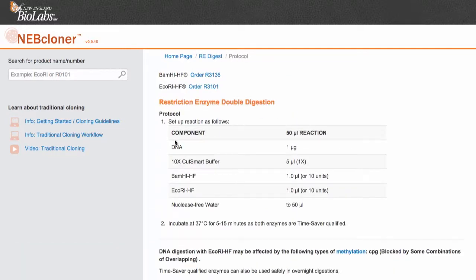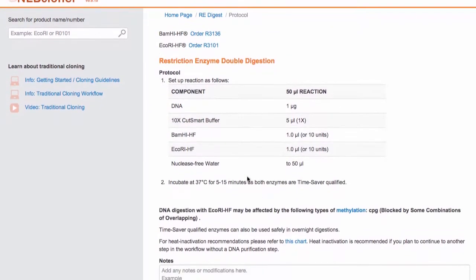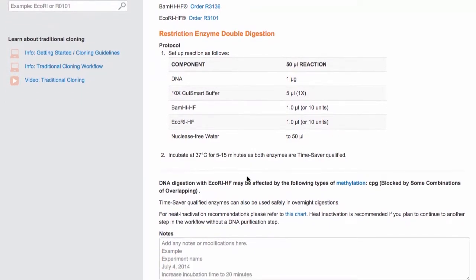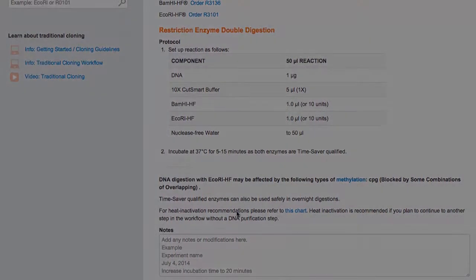Press Show Protocol. In the protocol, the tool chooses a common buffer because both enzymes have greater than 50% activity in a single buffer.